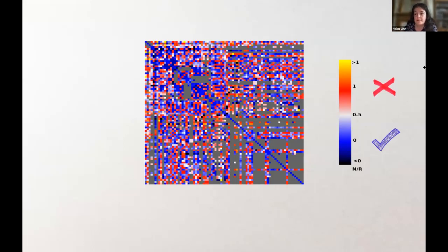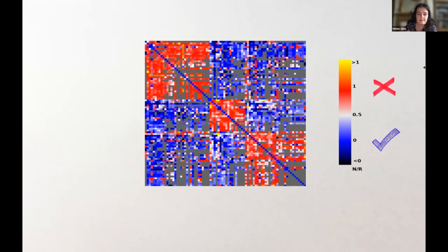And this is an unsorted matrix, so it's only using cluster4x and resorting the matrix to show that, just by changing the rows and columns and recalculating the matrix, we can see that this roughly corresponds to 3 separate regions where the antibody wants to bind at first glance on the receptor binding domain.